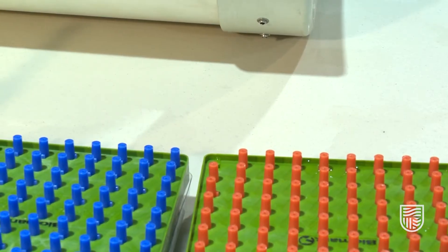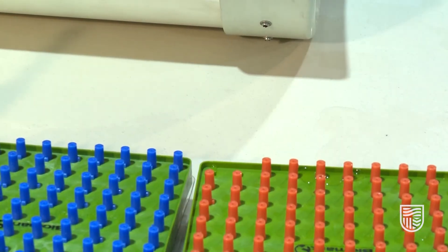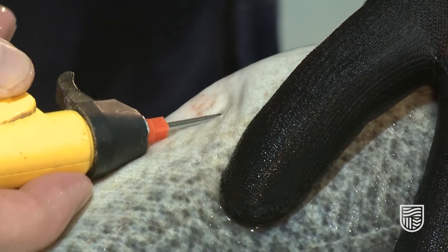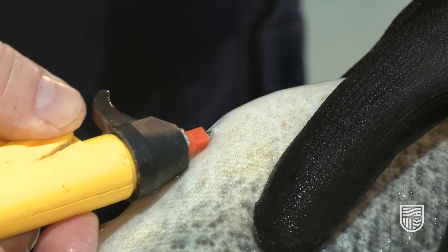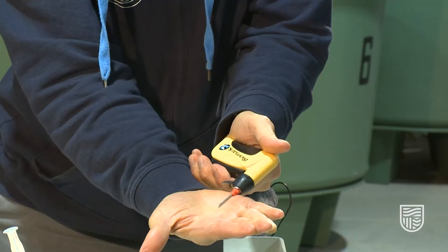Now we'll show the process for tagging a fish with a 12 millimeter tag — a slightly different process. Here we use the tag applicator gun, and these tags are pre-loaded into the needles so the tag is already in there. All we need to do is push the gun down on top of the tag; the whole unit then comes out of the system. When placing the needle into the fish, you pull the trigger.